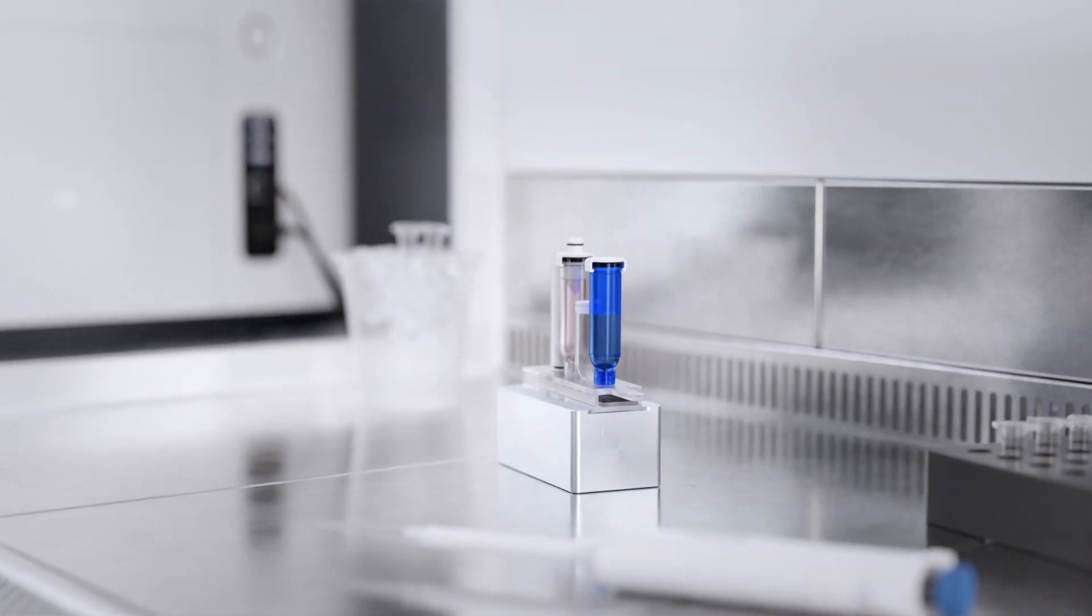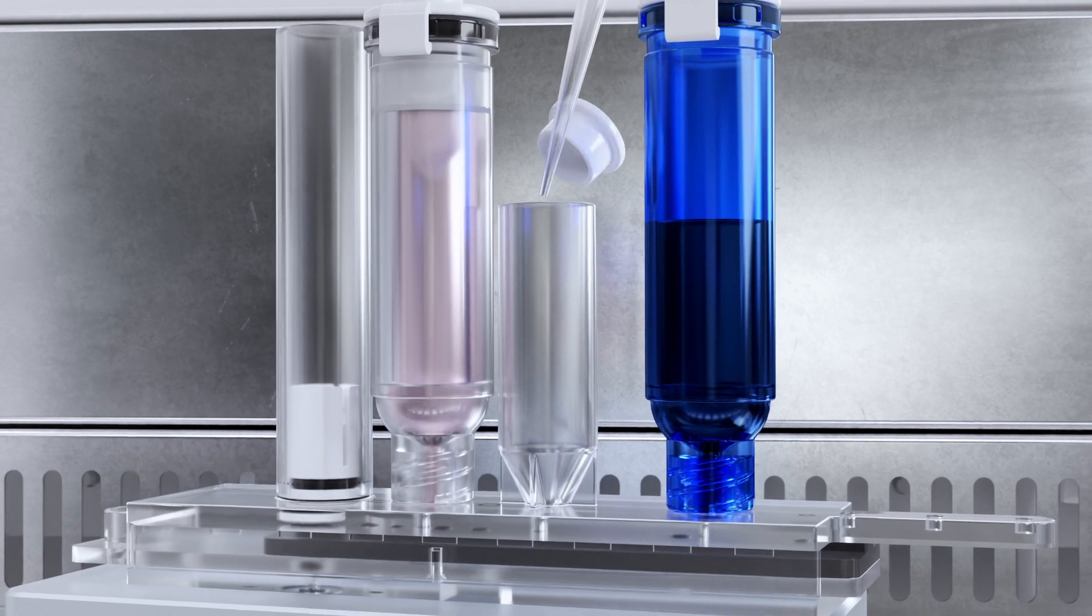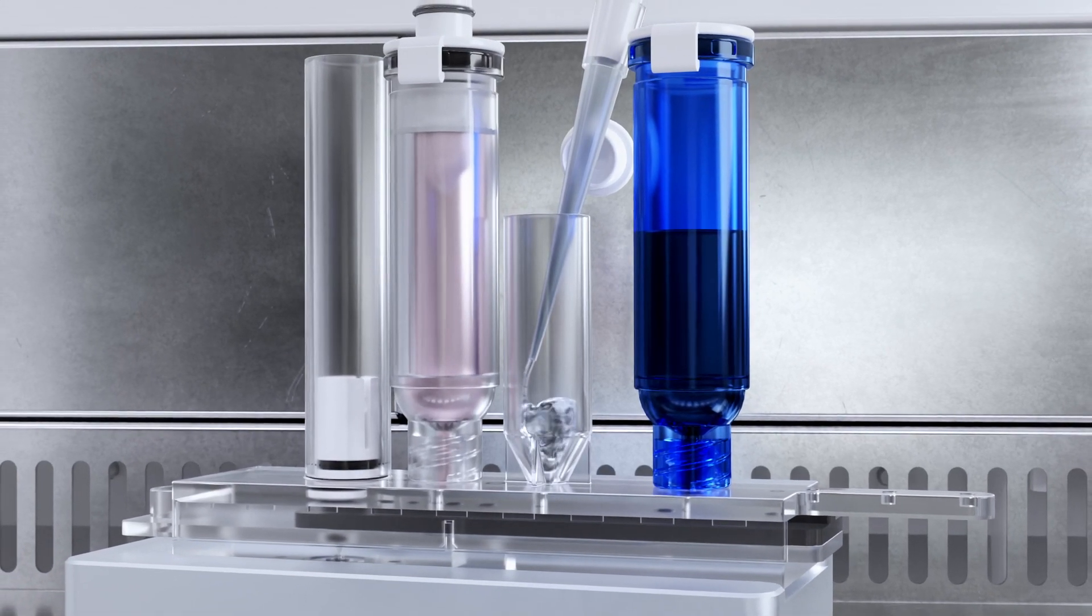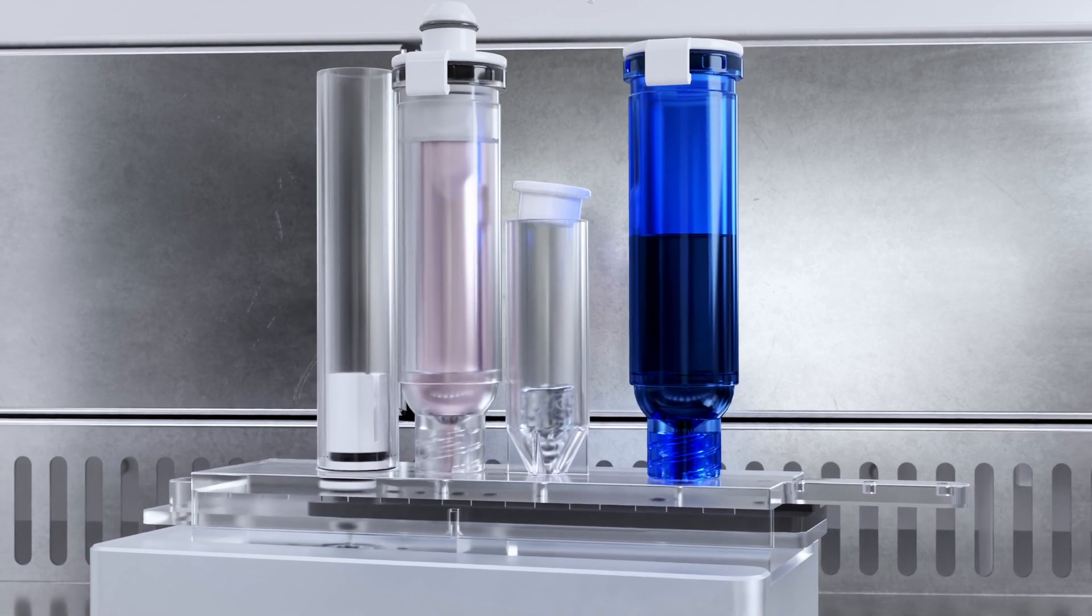Introducing the BioCellX, the first of its kind biodispensing system that enables researchers to simplify and automate 3D cell culture for greater insights.